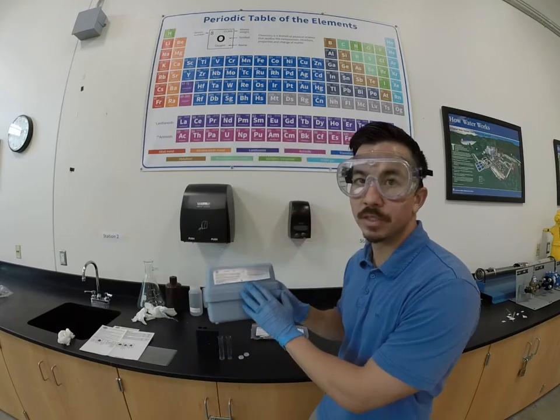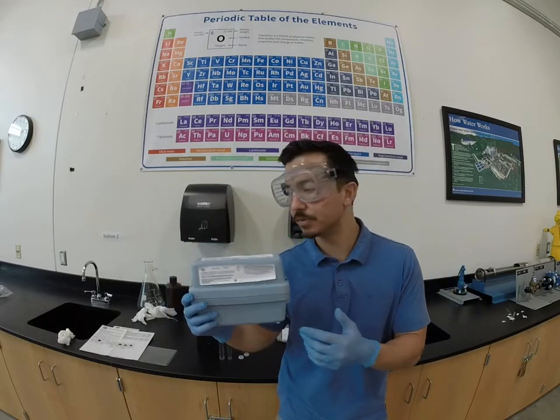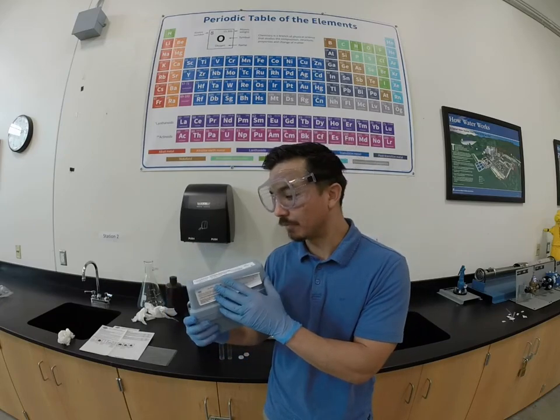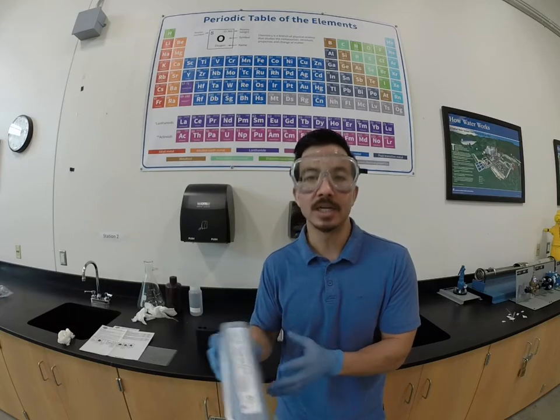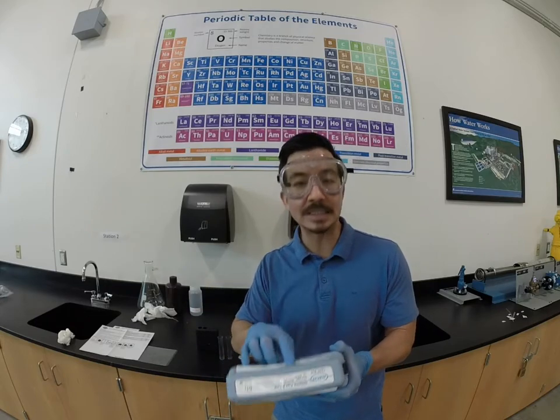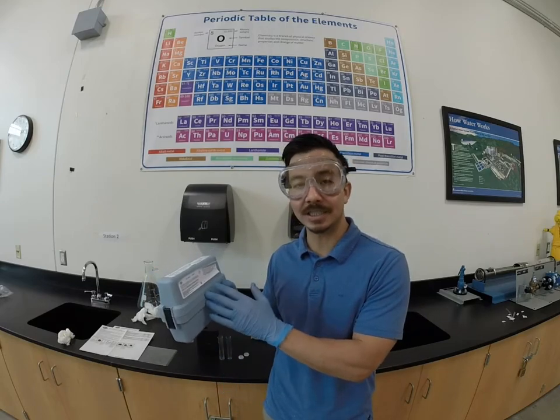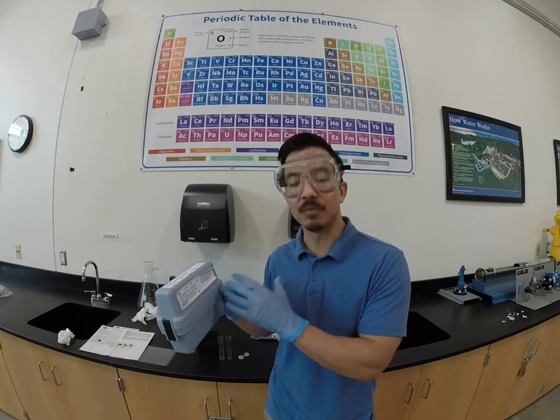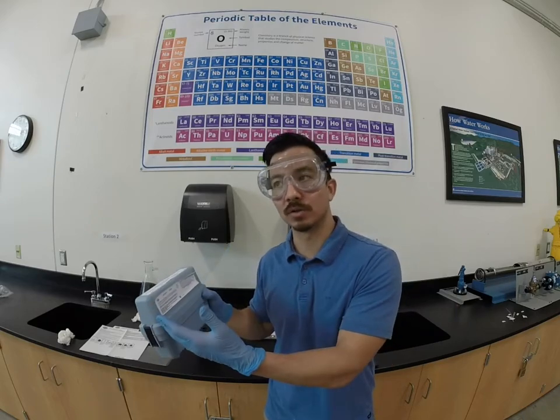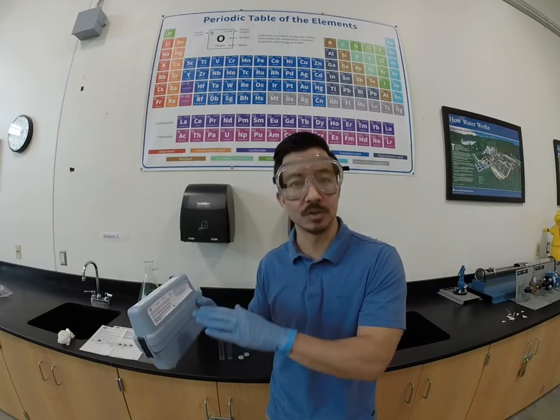This is the field kit we're going to be using. The brand on this particular one is Hawk, but there are different companies that make this. We're going to be using the DPD method. DPD — fancy name for diethylphenylenediamine — is one of the reagents that reacts with the chlorine, and in that reaction it turns pink. The darker the pink color, the more chlorine. No pink color means there's no chlorine in there.